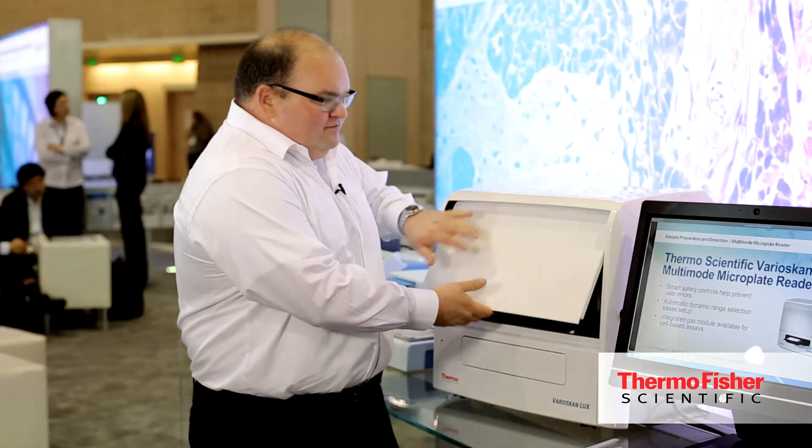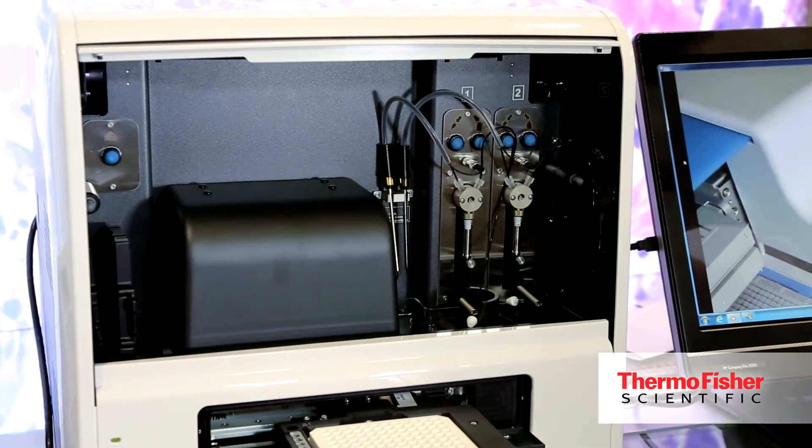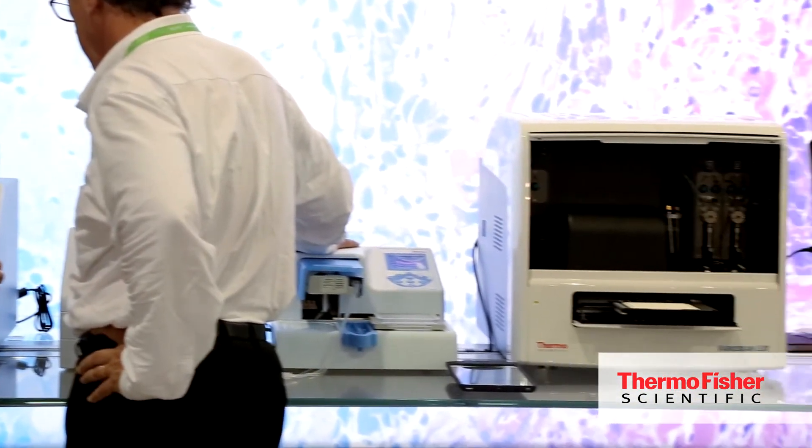On the inside, you can add up to two reagent dispensers. It comes standard with an incubator up to 45 degrees C and orbital shaking as well. The instrument also has an optional integrated CO2 and O2 gas control.